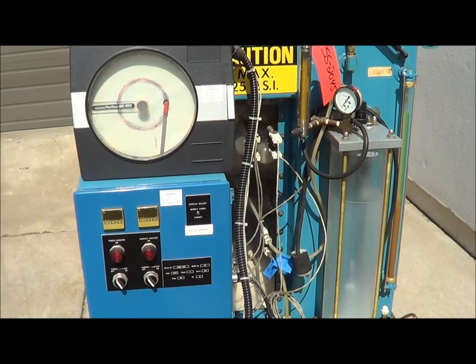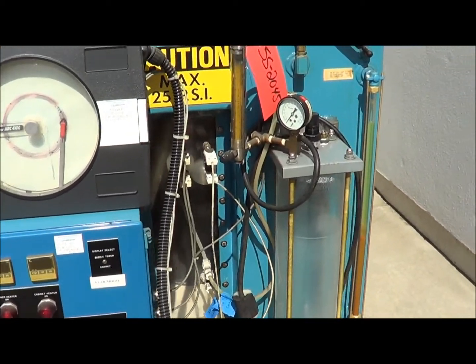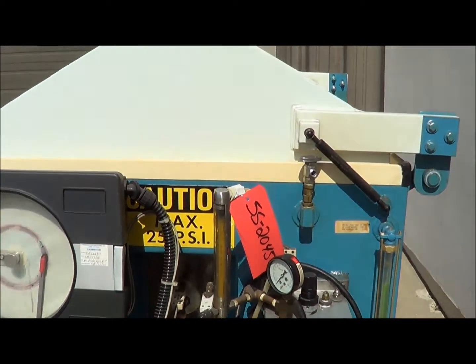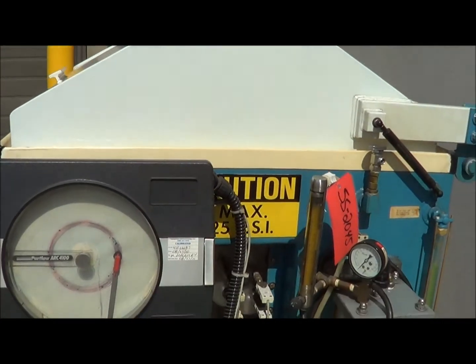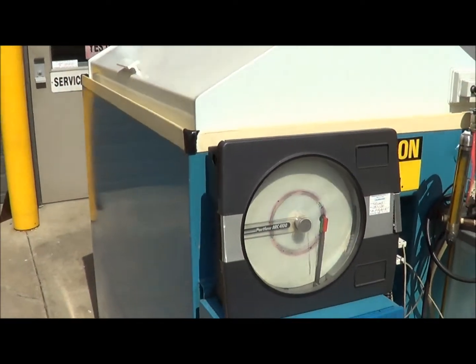That is the Partlow ARC 4100, 25 PSI max on this particular unit.